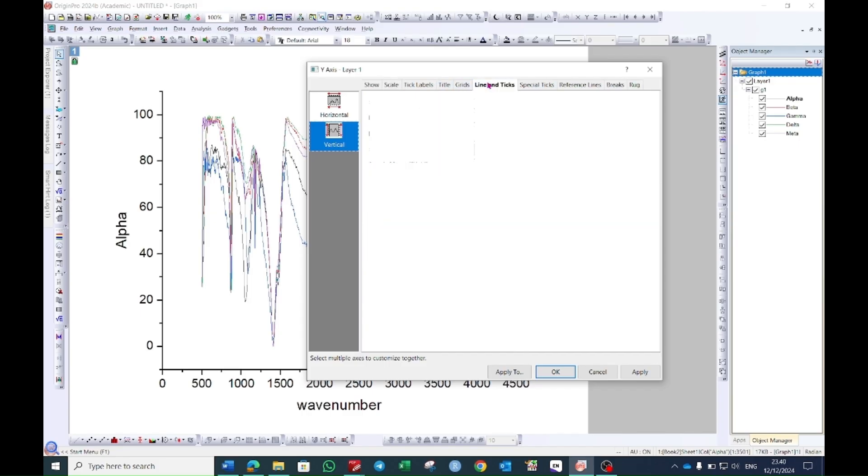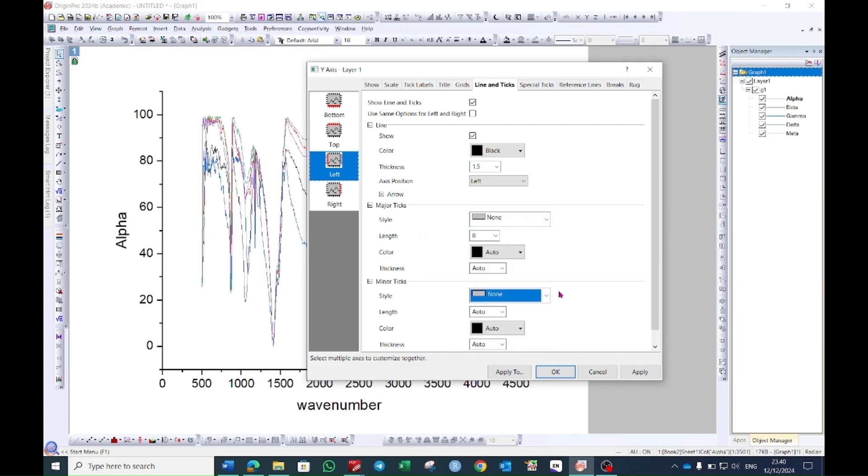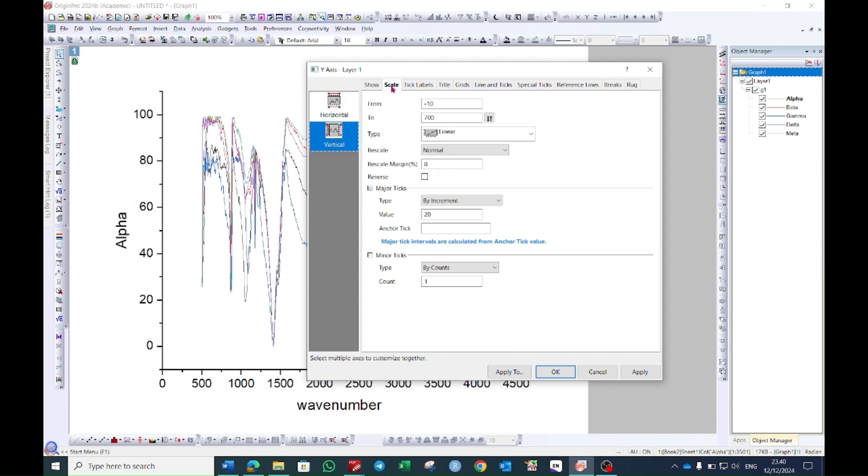Then go to line and ticks and here you will see major ticks. Keep it as none and for the minor also make it as none. Then go to the scale option again.